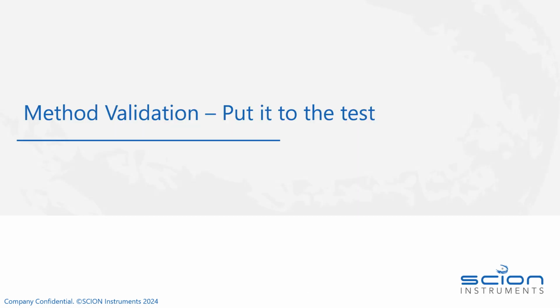So the final thing we should be doing when we're developing a method is to validate it in some way. So really put it to the test. We've run a standard, we're getting good sensitivity, good resolution of all the peaks that we're interested in. We've introduced the sample matrix and made sure that's not had any effect. But really we should be validating the method in some way. So there are certain criteria that we should look to fulfill.